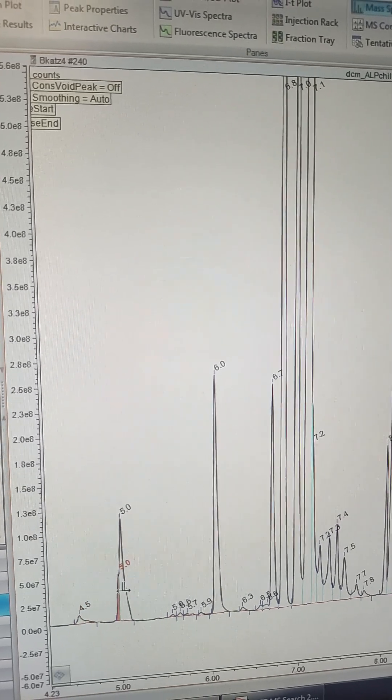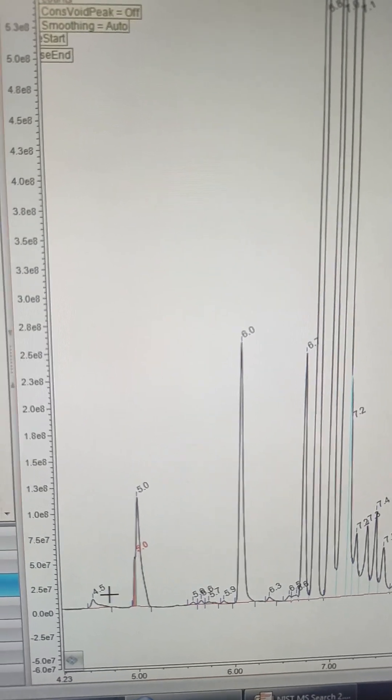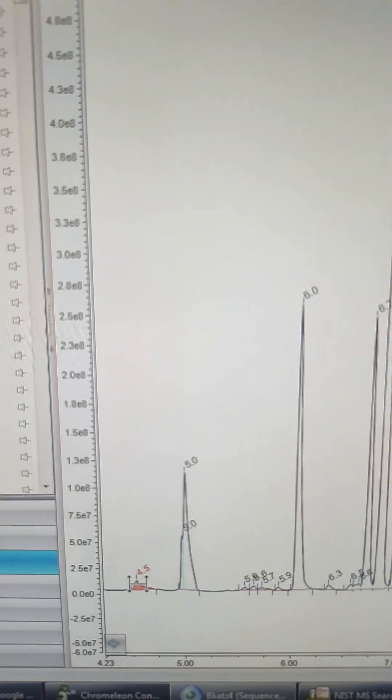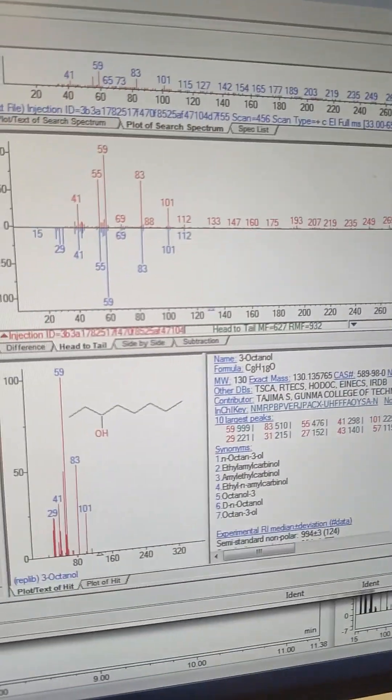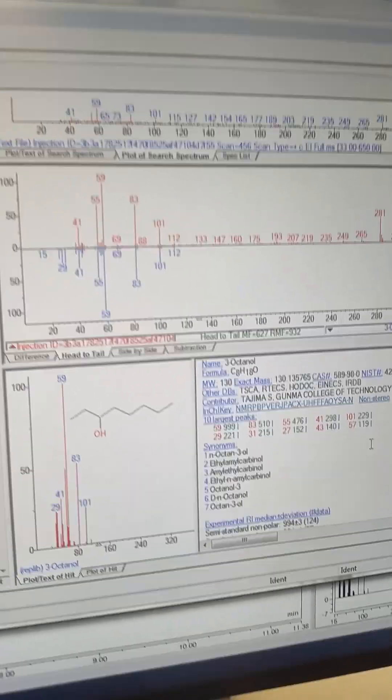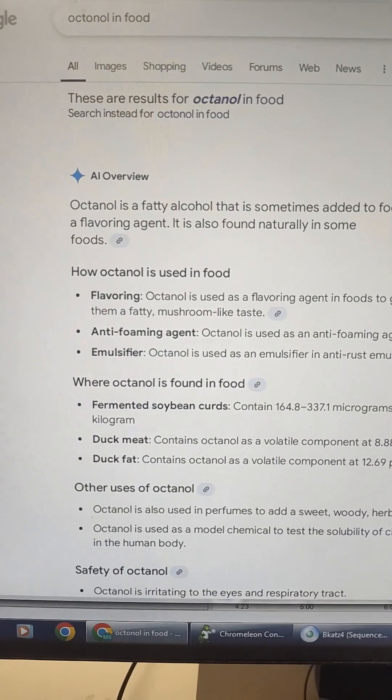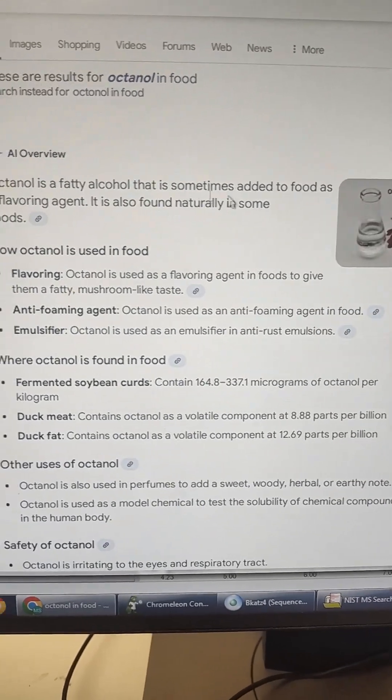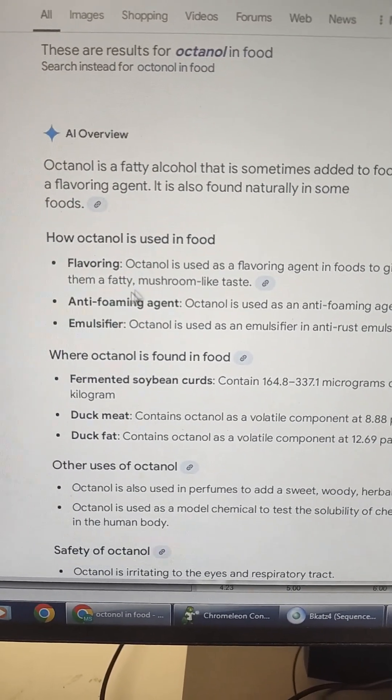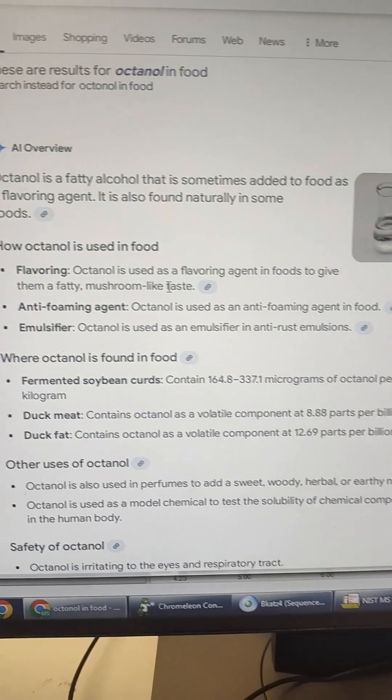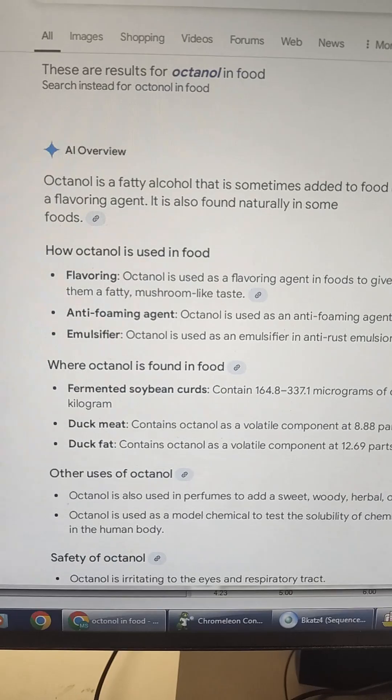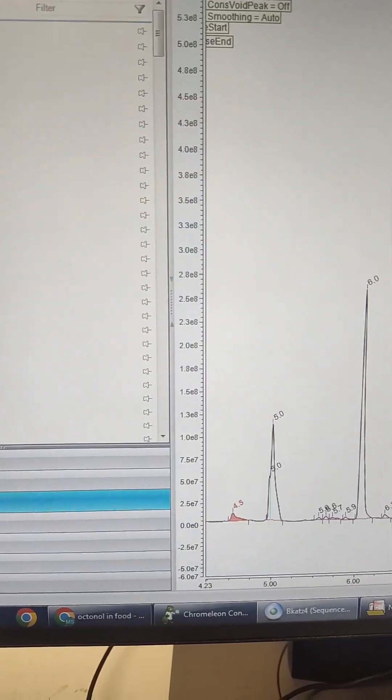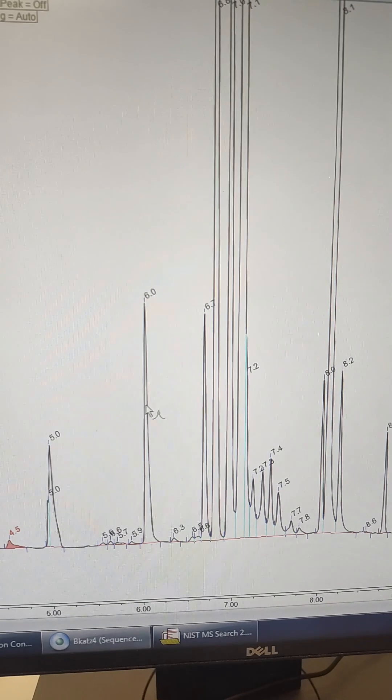The first one we got here is eucalyptol, this one right here. Minor minor amounts of what looks like, I don't know, let's search it. It's saying that it's octanol. I don't know why there's octanol in there, we'll dig into that more. Apparently octanol is allowed, is a fatty alcohol allowed in food as an additive and it gives you that kind of like a fatty mushroom-like taste. I don't know why duck meat, I guess you got like a fatty duck meat flavor in there. I'm all right, why not, why not add that, lots of flavors.